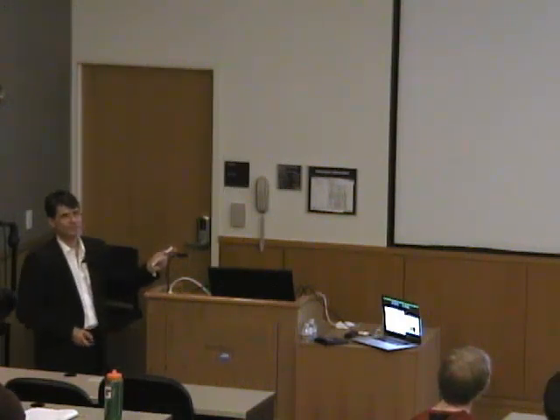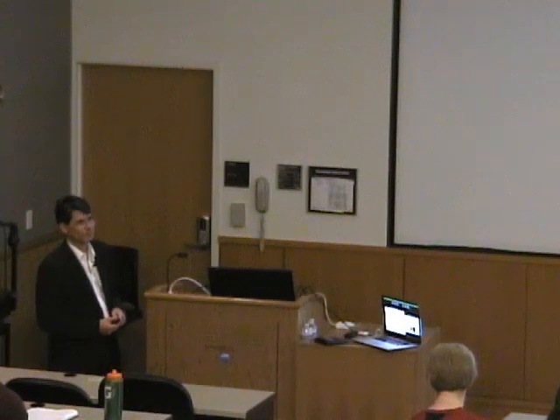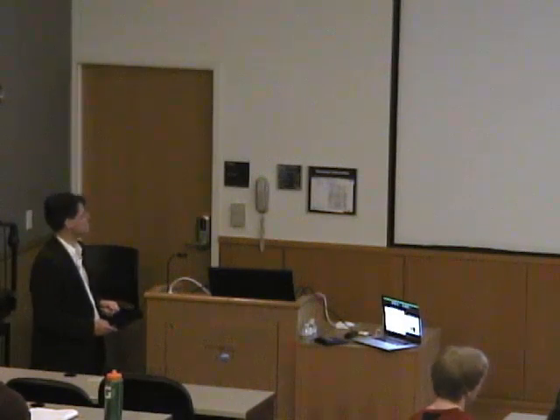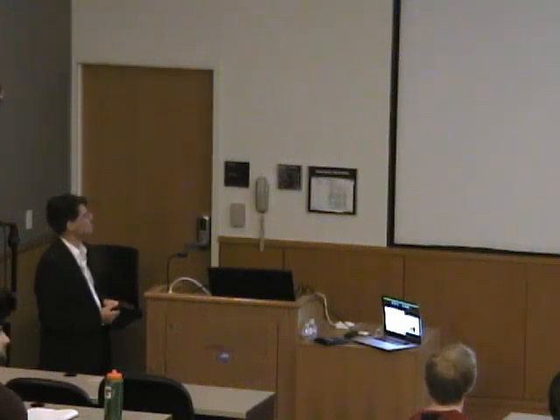This is your best case scenario. In this case, the MCD is most sensitive to the ground state spin Hamiltonian parameters, and you get a nice determination of the spin Hamiltonian parameters.